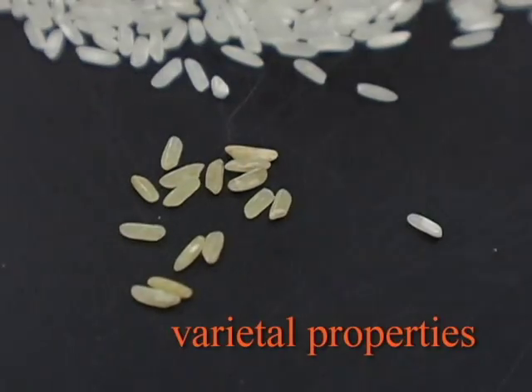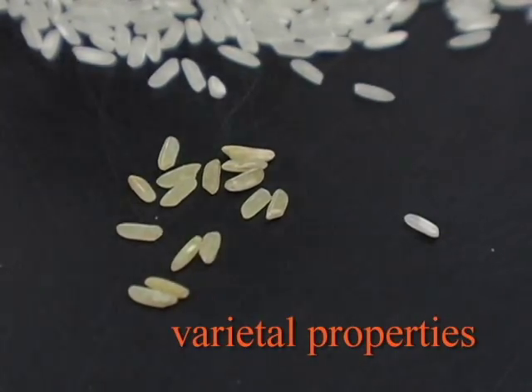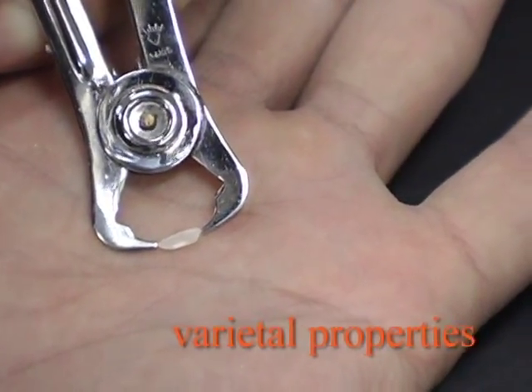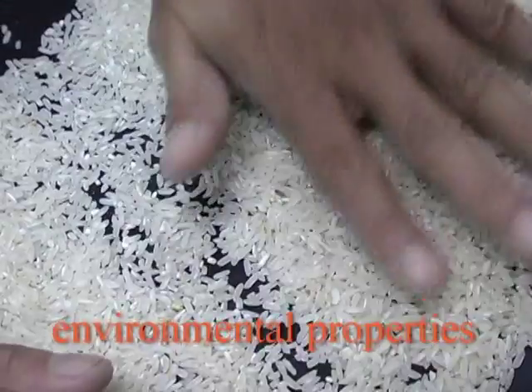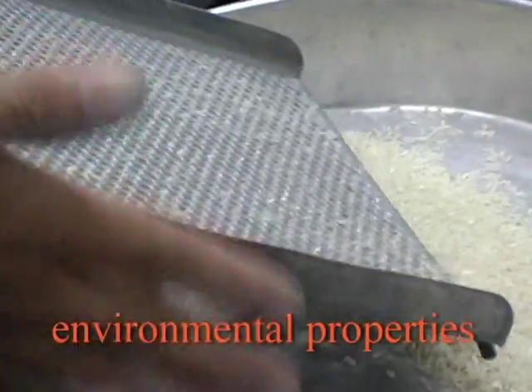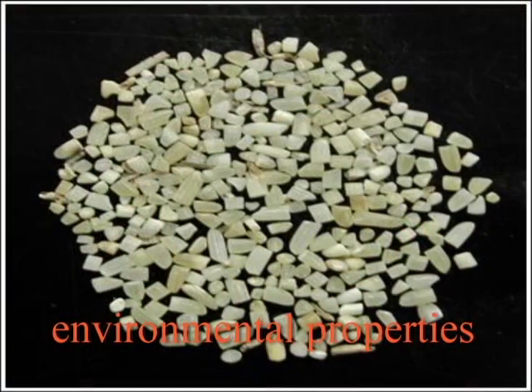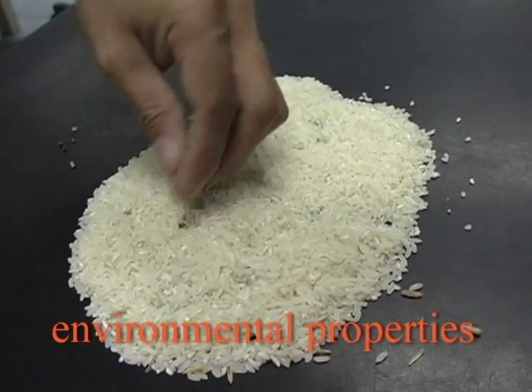Some varietal properties include the color of the grain, its shape, size, chalkiness, and bulk density. Some important environmental properties determining white rice quality are moisture content, head rice recovery, grain dimensions, whiteness.